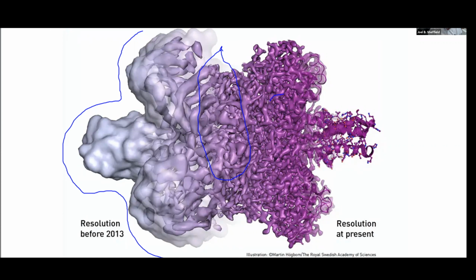And then you begin to see more detail as we go in through the different amino acid structures. And then eventually, as we get up to where we are now, people are actually starting to visualize what looks like individual atoms. And what I want to do is go through a little bit of the history of how this thing evolved. Because what's interesting, among other things, is that it changed technologies enormously.